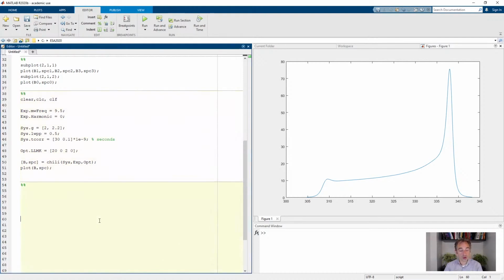Let's talk about partial ordering. So one big application case for nitroxide spin labels and slow motion simulations is to model nitroxides attached to proteins. And if a nitroxide is attached to a protein, it will still have its intrinsic mobility due to its size and shape, but this motion will be restrained and hindered by the surrounding protein environment. In fact, it can be hindered so much that some orientations are completely inaccessible for the nitroxide because it just might clash with other side chains of the protein.